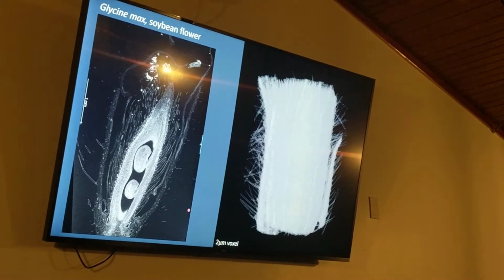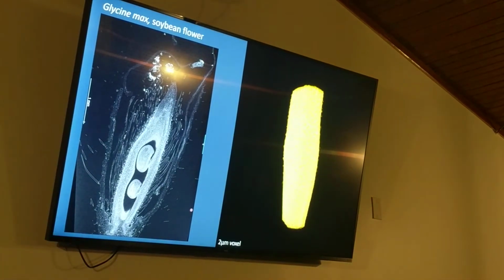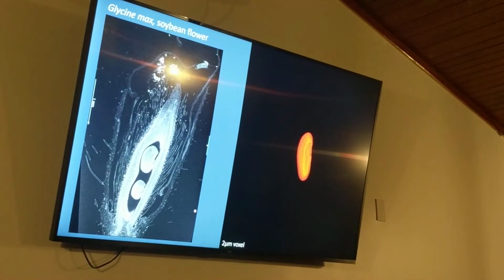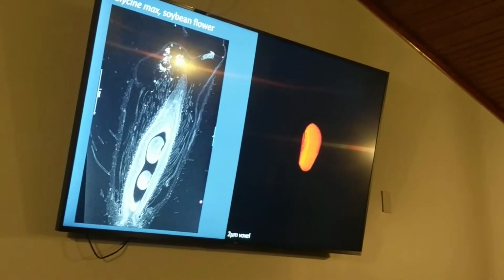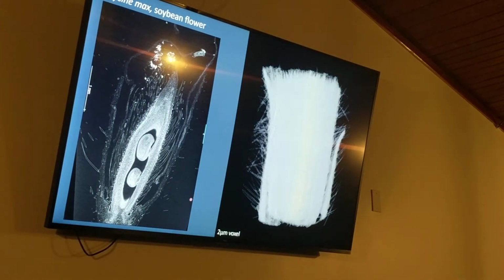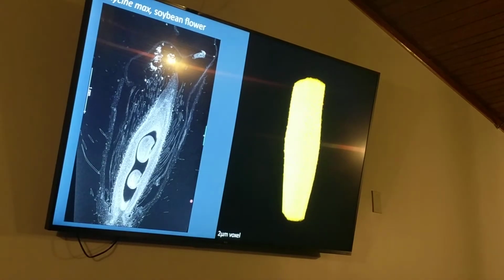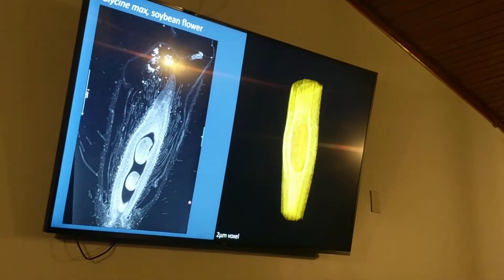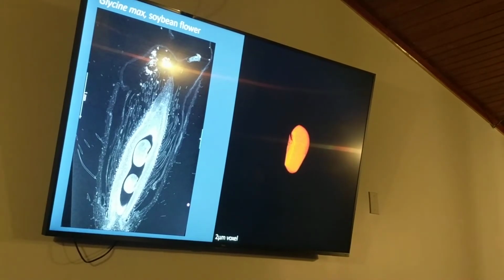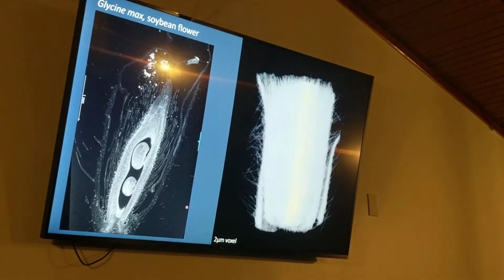But cool pictures, so what? Bring in Nee to actually pull biology out of the scan. We can't do anything until it's actually identified, segmented, and measured. And that's where Nee and Mao just work their magic. I get some cool images, I get the fun part. They carry the weight of the lab by doing all this work. So now anything that's in a different color can be independently measured.